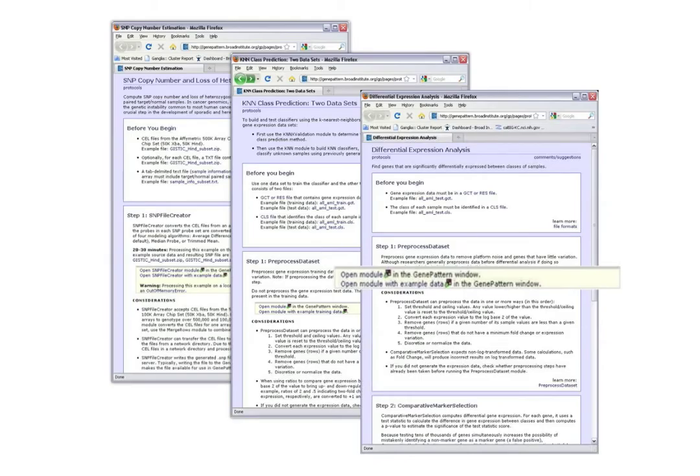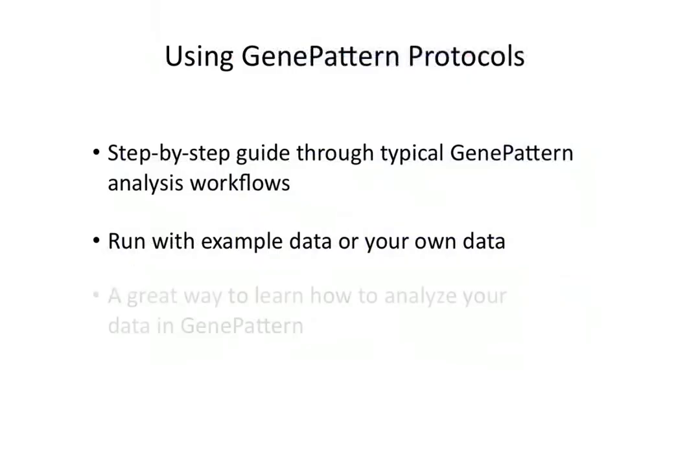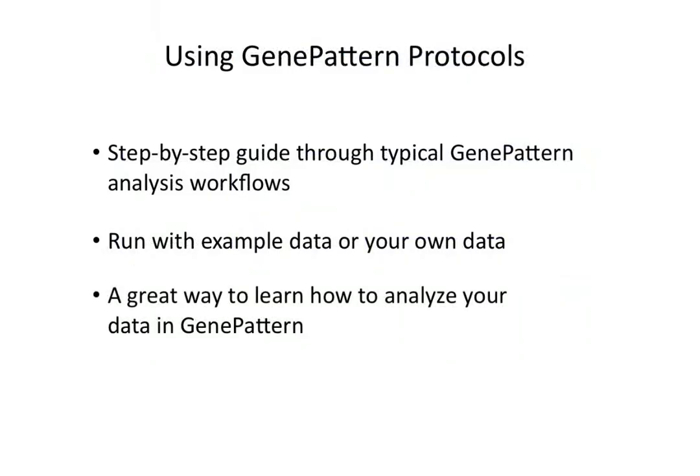For this tutorial, we will only explore one protocol, keeping in mind that all the same kinds of functionality and information are found on the other protocols as well. So let's say we often work with expression data, and we know we are interested in using GenePattern to cluster that data.